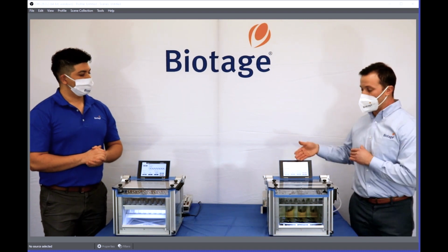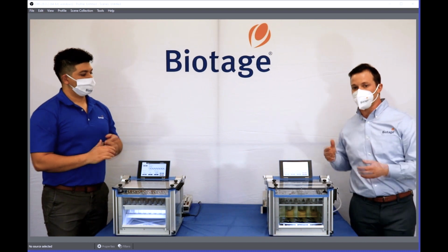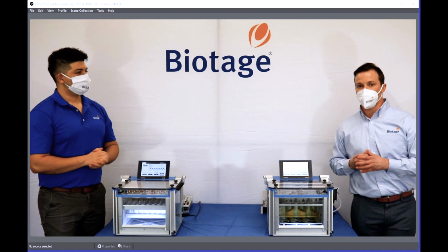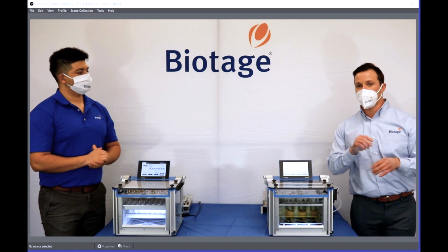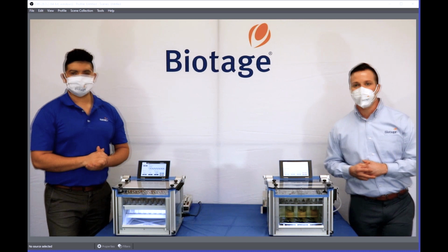But when you're actually programming the flow on the system, you'll be talking in liters per minute. And as Mario said, there is a conversion chart. So for those of you that were classic TurboVap users, you can easily convert your method from PSI to liters per minute when it comes to actually your flow on your method.